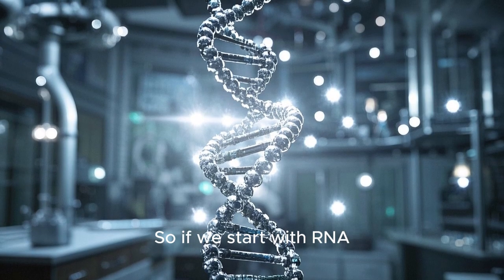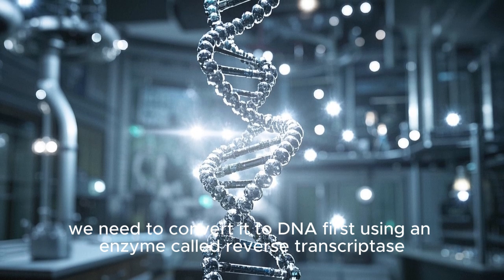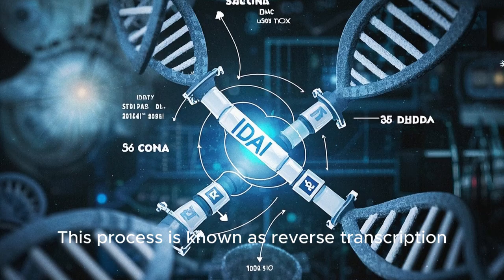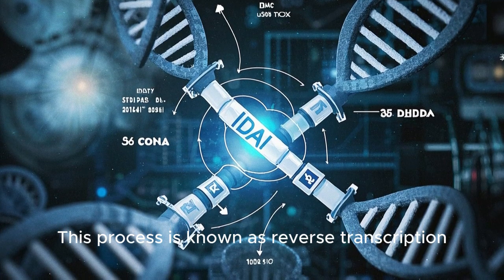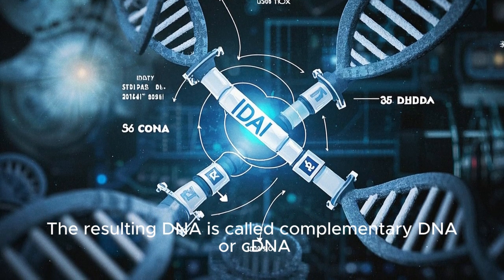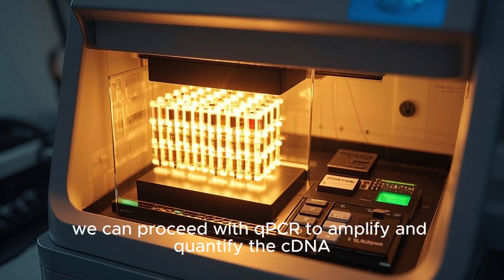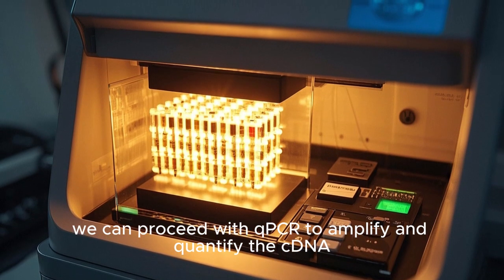So if we start with RNA, we need to convert it to DNA first, using an enzyme called reverse transcriptase. This process is known as reverse transcription. The resulting DNA is called complementary DNA, or cDNA. After this initial step, we can proceed with qPCR to amplify and quantify the cDNA.